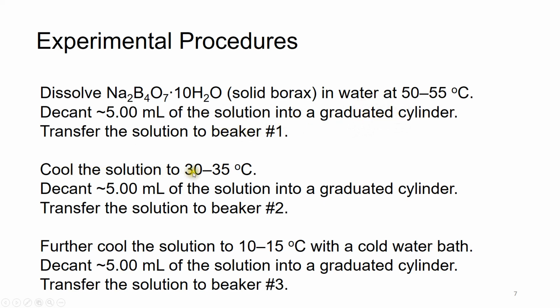And then you cool the solution to 30 to 35 degrees Celsius. Again, decant about 5 milliliters of solution into a cylinder. The reason is we need to measure the volume with this graduated cylinder. Do the transfer, rinse the cylinder, transfer everything into beaker 2.